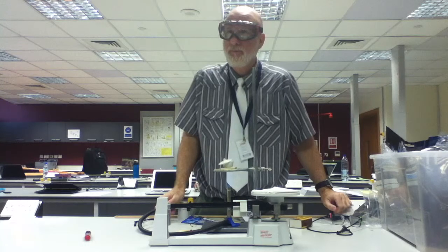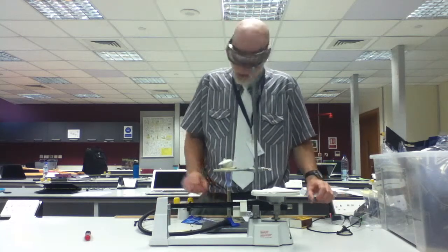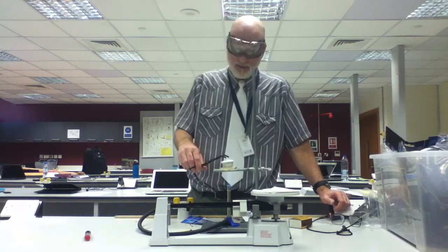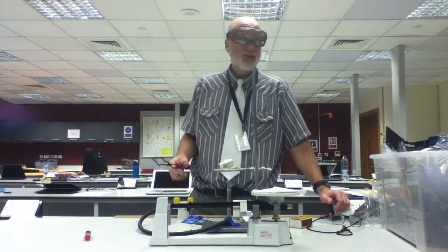Yes? You got to speak up. You didn't leave the top of the crucible open so it could react with the... Well, yeah, the air's got to get in there, but you want to keep it on for a little bit until things get a little hotter. And then you want to leave it off a little bit. Okay? But you want to make observations.